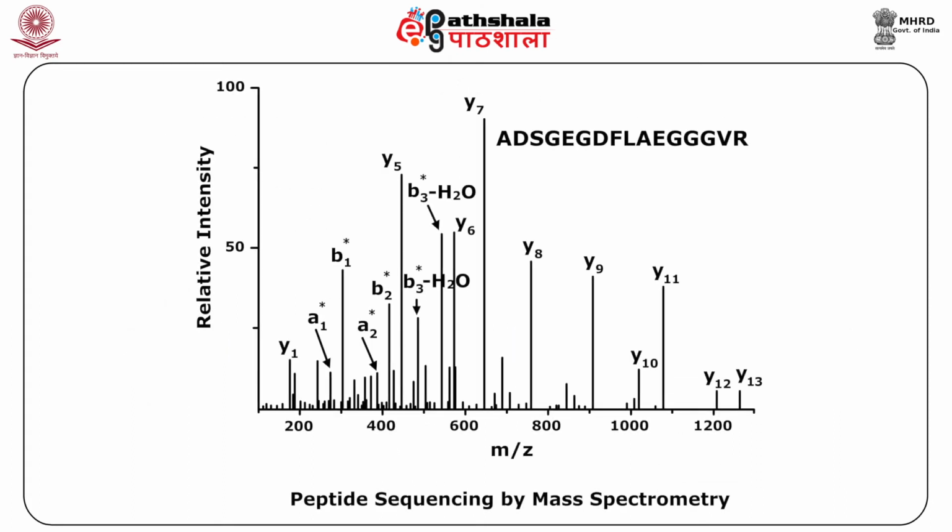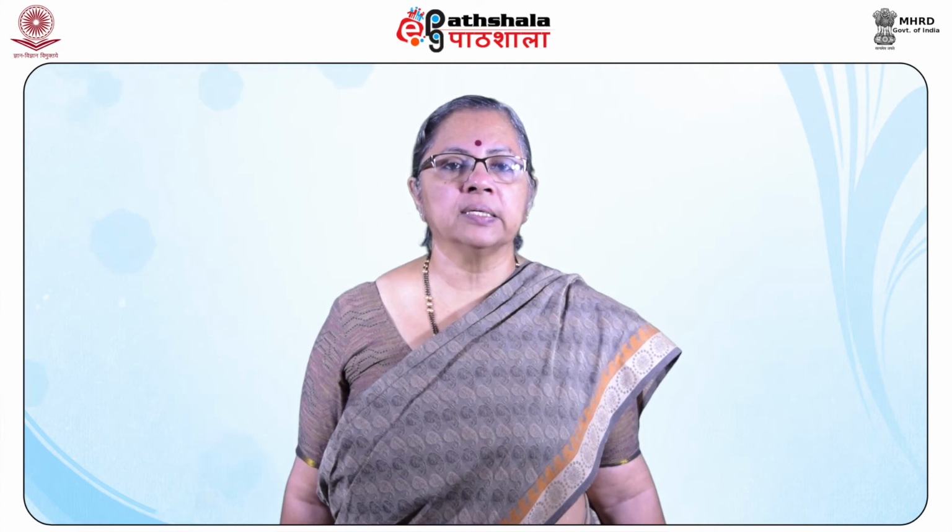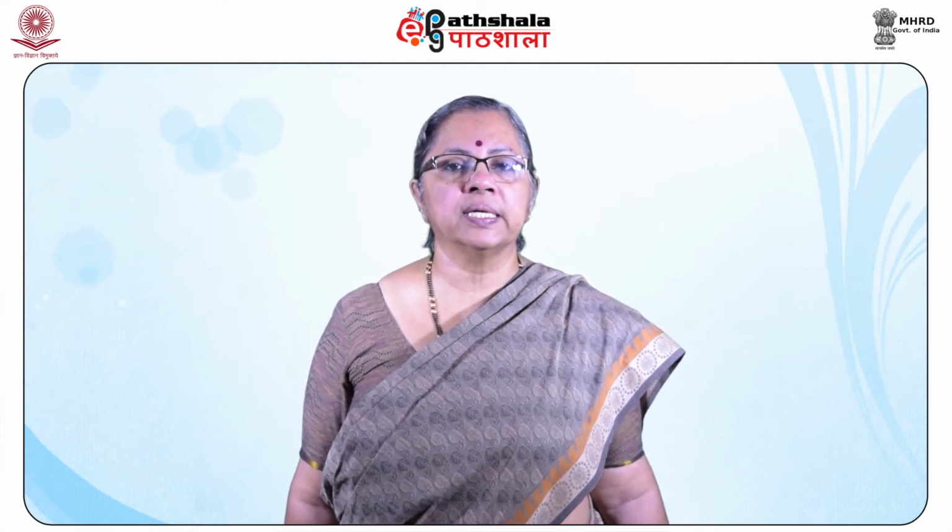Observe the figure which gives a spectrum of the analyzed peptides from the mythical polypeptide. Plotted on the y-axis is the relative intensity and on the x-axis the m/z ratio. I hope it is obvious that more right in the graph refers to basically the smaller charge and therefore the higher m/z ratio.